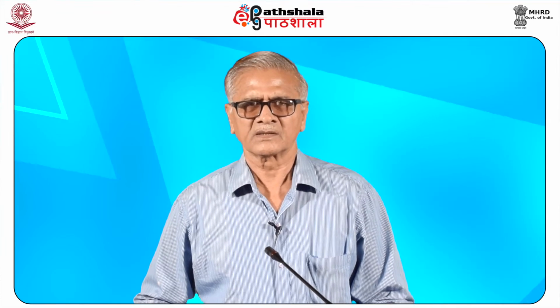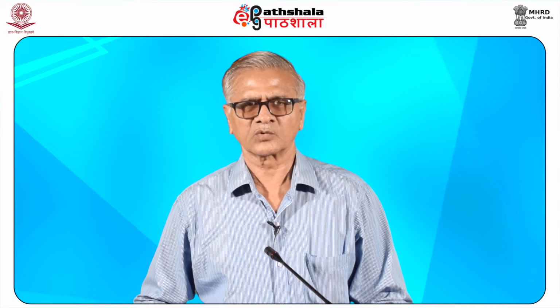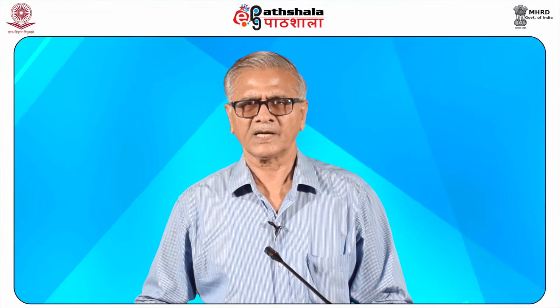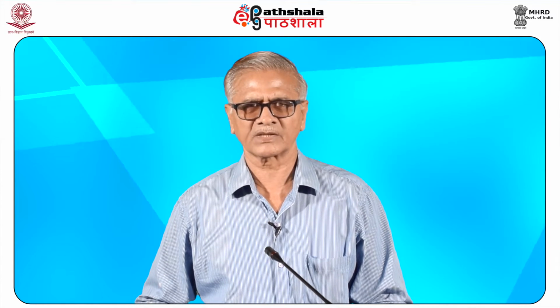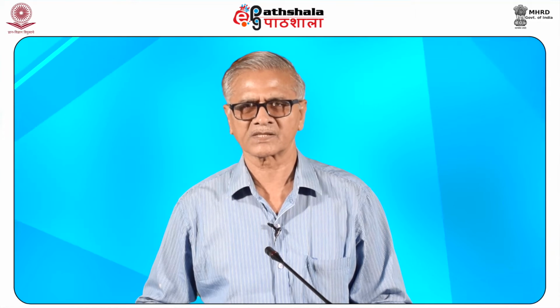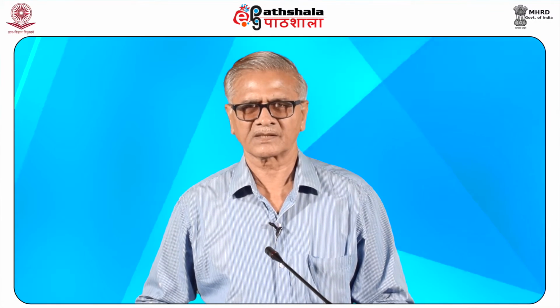Frederick Sanger then adopted this primer extension strategy to develop a more rapid DNA sequencing method at MRC Center, Cambridge, UK, and published the method for DNA sequencing with chain terminating inhibitors in 1977.